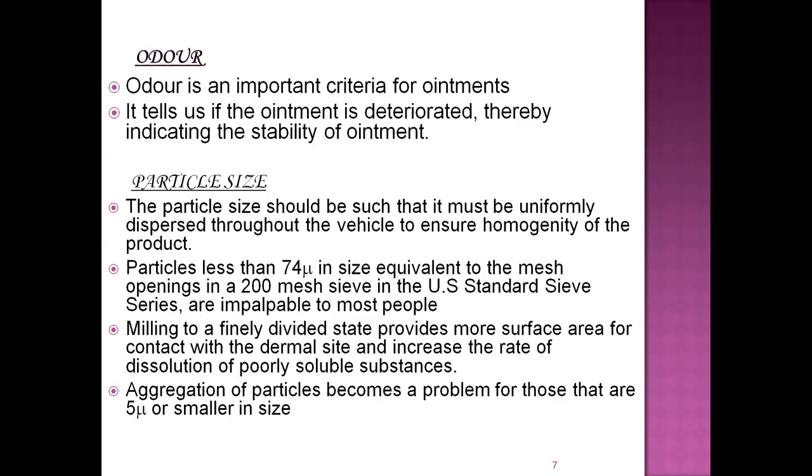Third one, odor. Odor is also a very important criterion for ointments. It tells us whether the ointment has deteriorated, thereby indicating the stability of the ointment. That is the reason odor, color, and appearance are all very important.